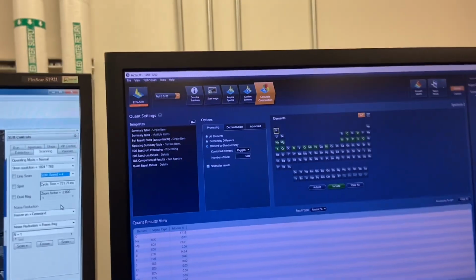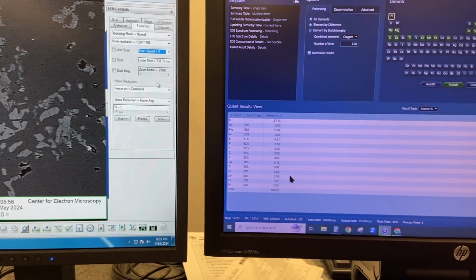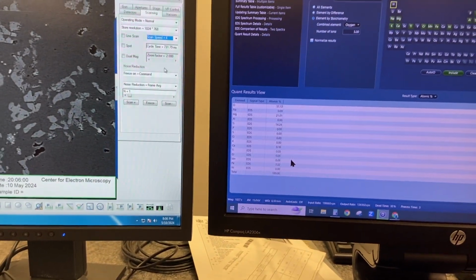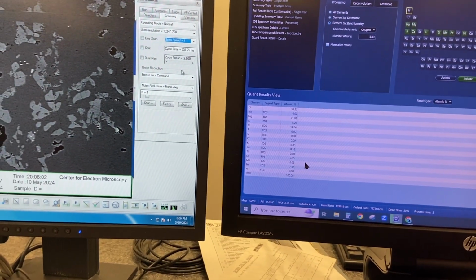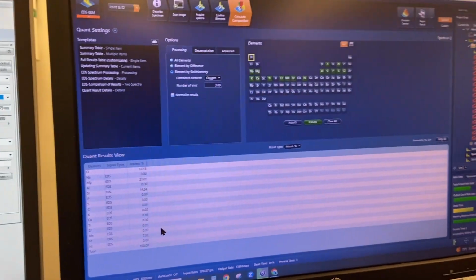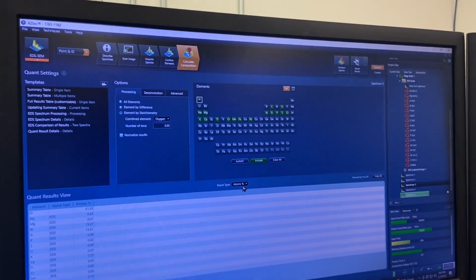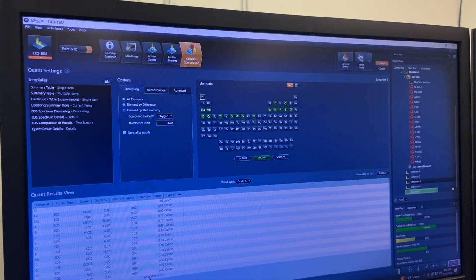On Earth, on the Moon, on Mars, you get different ratios. On HEDs, you have different iron manganese ratios. So basically, this is consistent with something that's lunar. But obviously, we're not just going to check olivine. We have to see other minerals. So I'm going to look at feldspar. And here's a feldspar right here. You can see, okay, that's consistent.